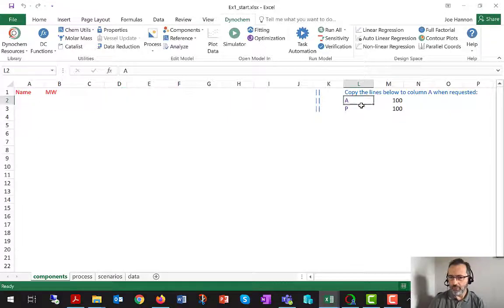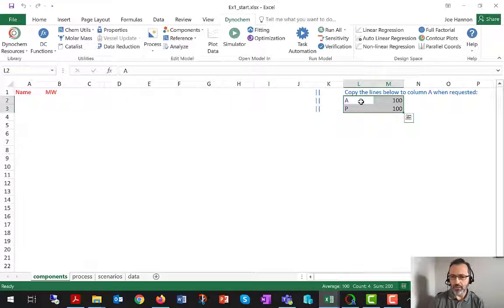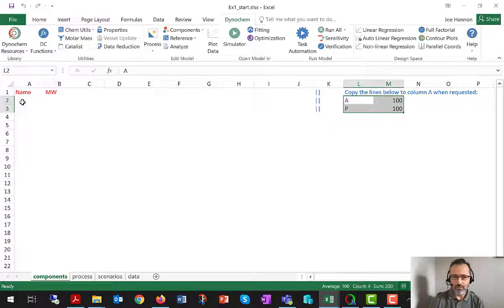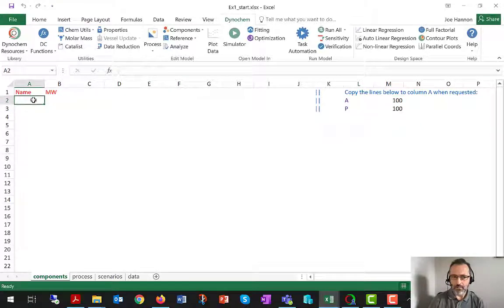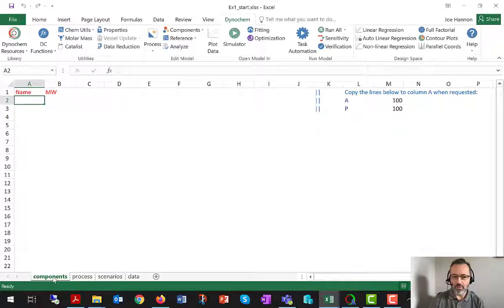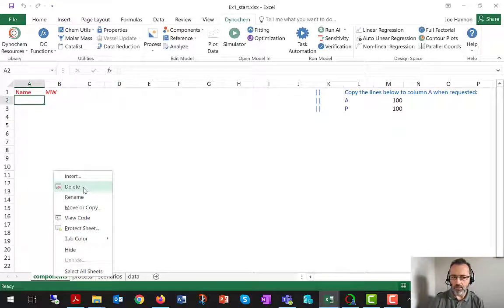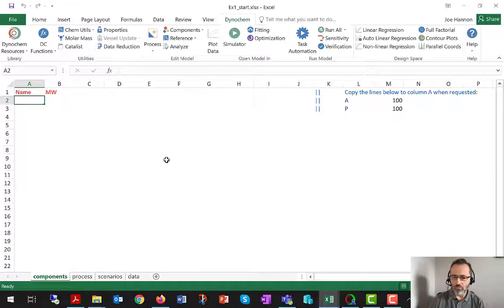If it was a full Dynachem model with statements, phases, and rates, it would have these guys in violet underneath name and molecular weight. In Dynachem 6, you can actually dispense entirely with the components sheet if you have no components in your model.